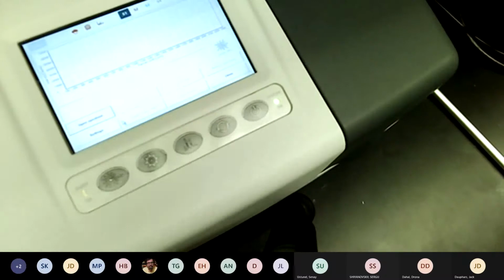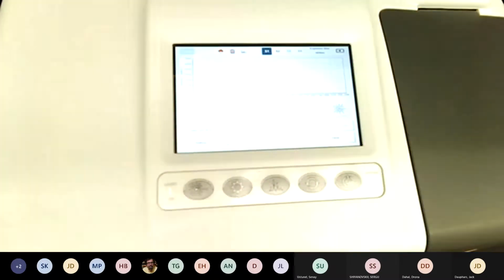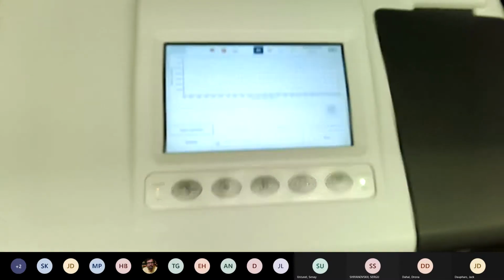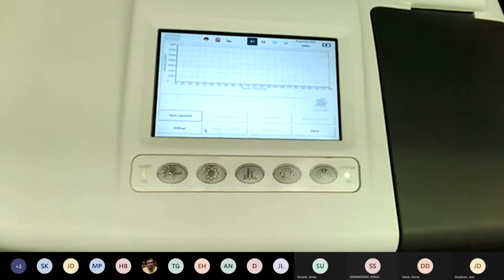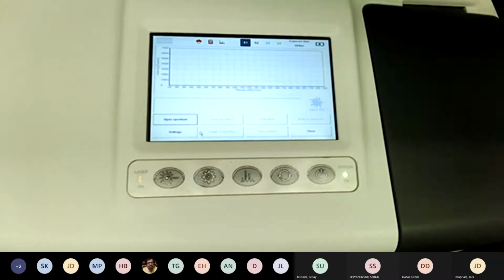Can you try turning off some overhead lights in that room? Okay. Will it autofocus is the question. No. Okay. How about now? Is it a little better? Because the screen is really so tiny. Yeah, it's a little better now. Okay. I don't know about everyone else in the call though. I mean, I guess without moving it, yeah, we can.